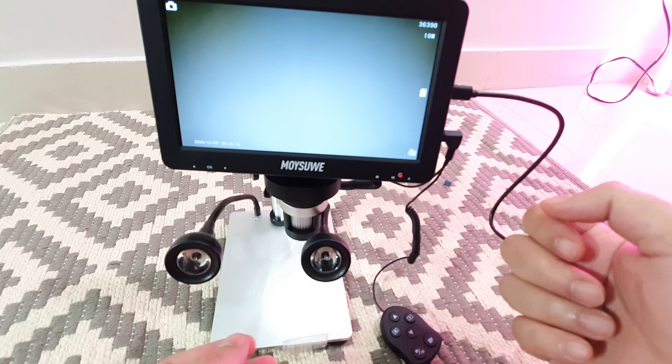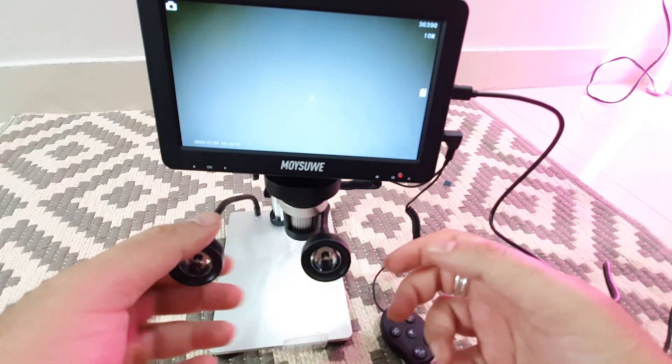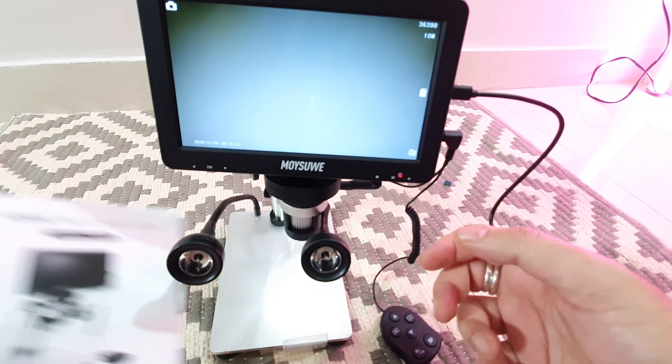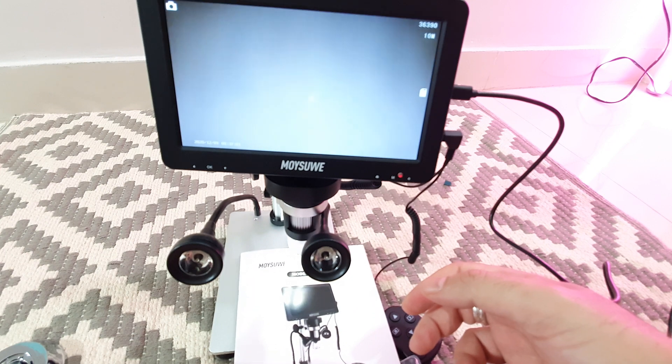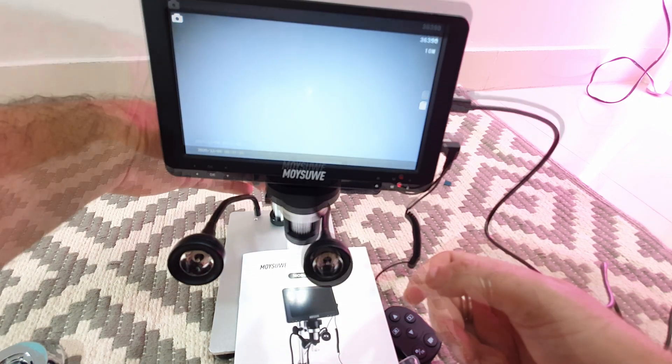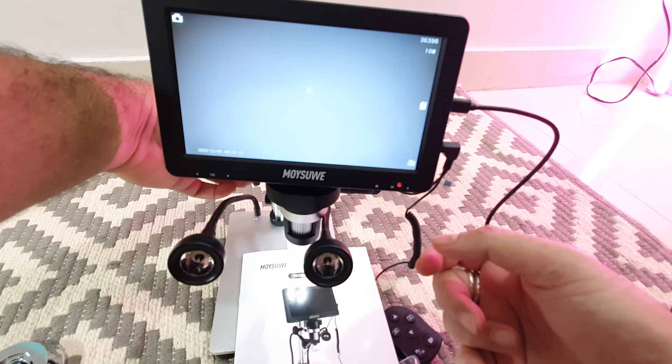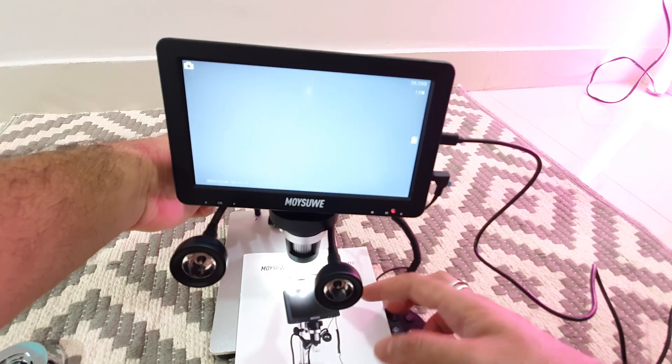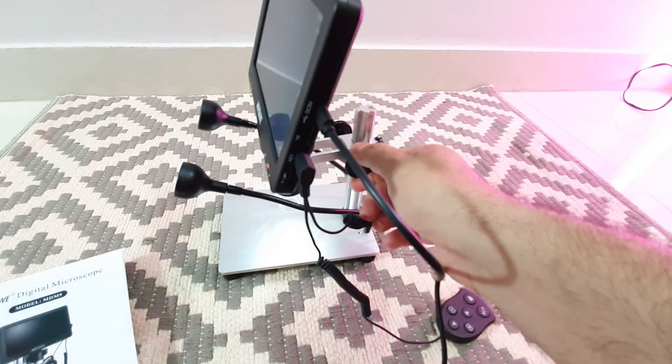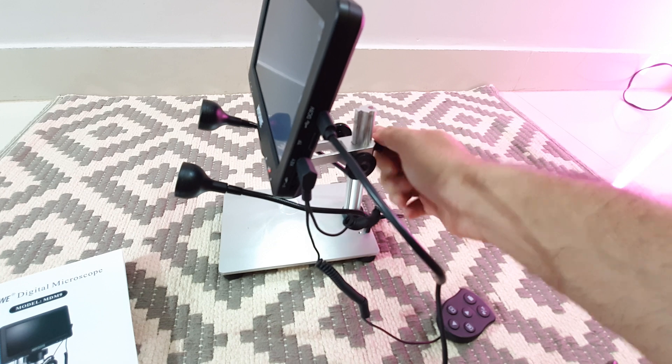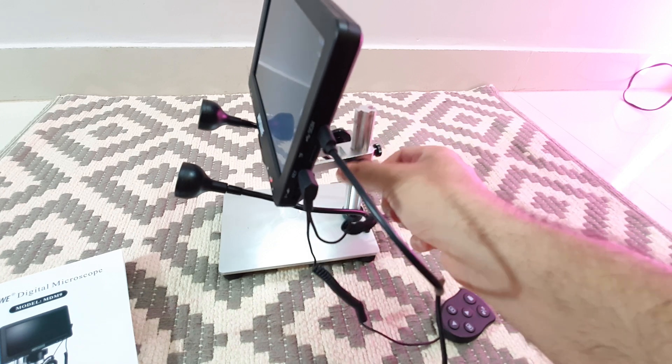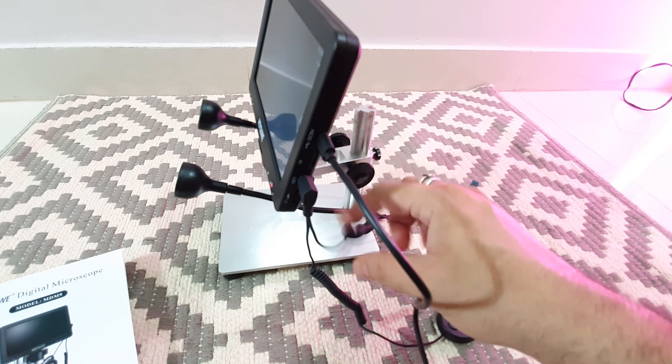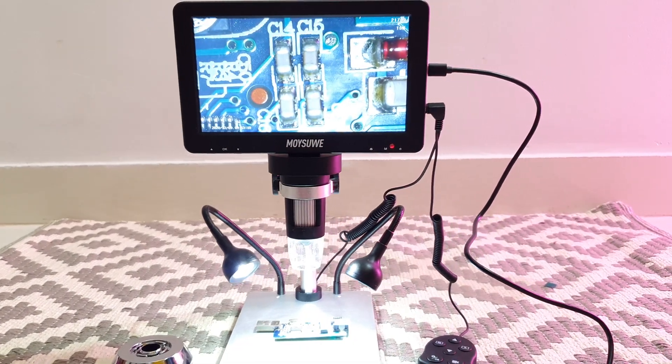You can see the whole base plate is actually glowing. And this boots up so quickly, there's no logos and nothing else. It's so fast to set it up. You can straight away start putting things under it and it will start showing you display. Let's adjust the height, just trying to see how much you can adjust this. There's not a lot of space for you to actually move it up and down, but it's reasonable. This is the amount of throw it has. You can loosen the screw at the back to make it run faster up and down. I would say about 20 centimeters is what it can move. The movement is really smooth. It's all set up.